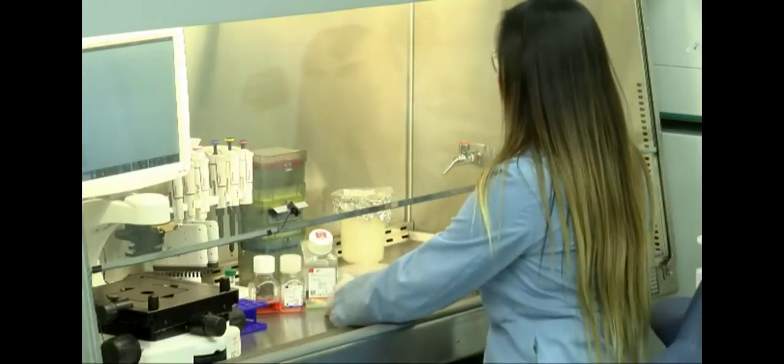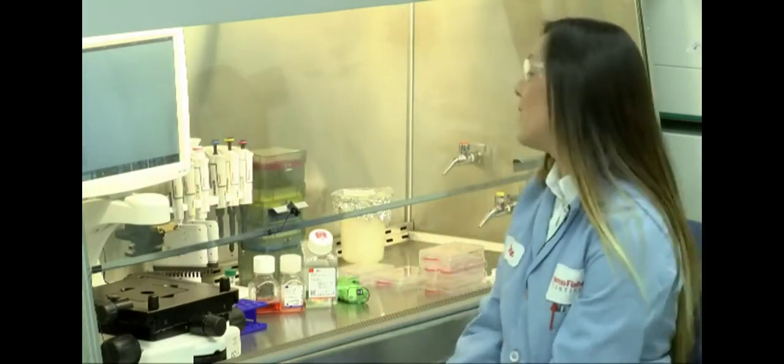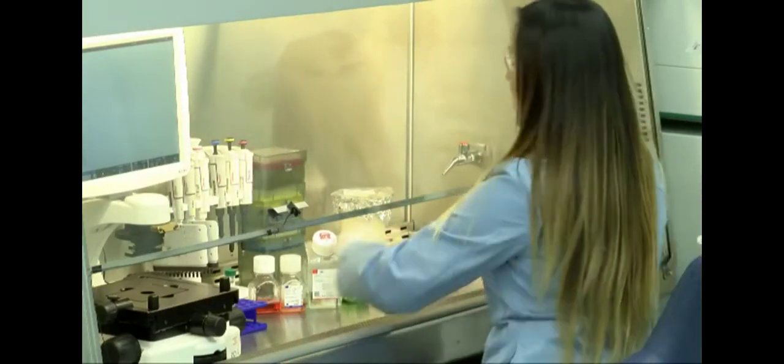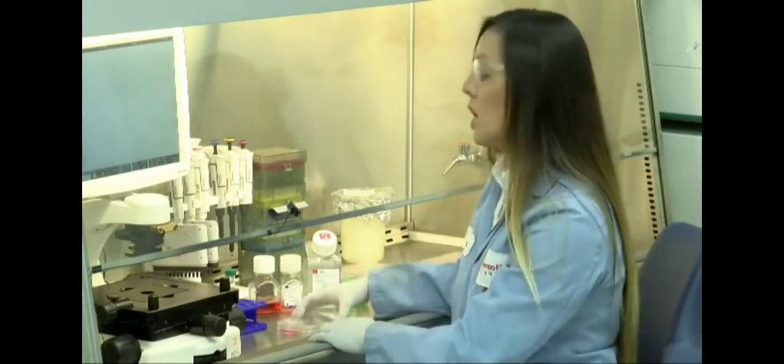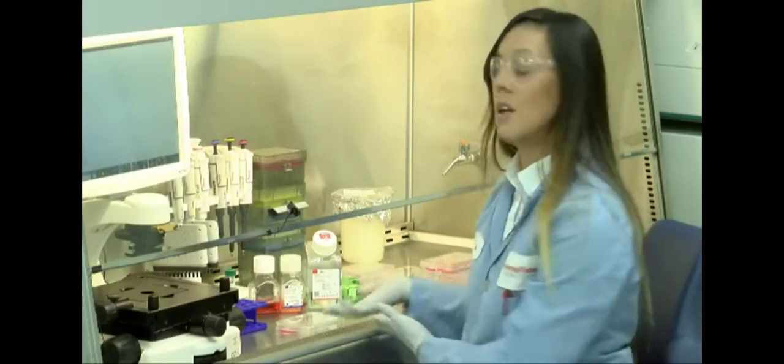So now that we've talked about neural induction a little bit and how to get our NSCs from our pluripotent stem cell cultures, we're going to dive in and do a neuronal differentiation. So the first step in neuronal differentiation is you're going to take your already dense culture of NSCs. So say the ones I just showed you go about 4 to 6 days till they're confluent and ready to passage. At this point, you can either freeze them down and create a bank of NSCs, or you can put them in maturation media, which is what we're going to do right now.